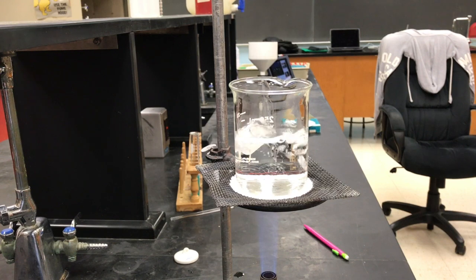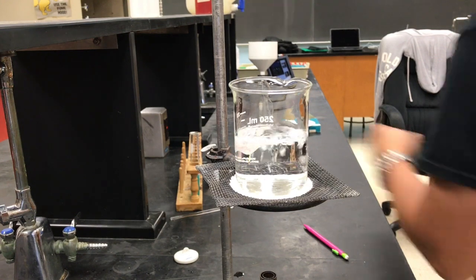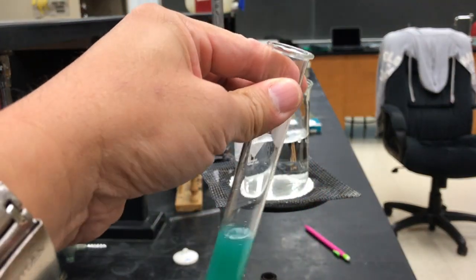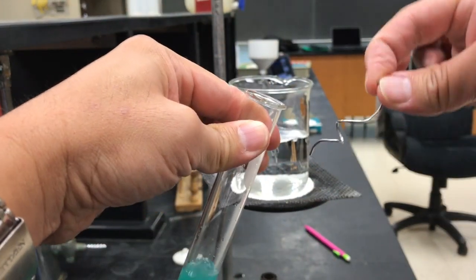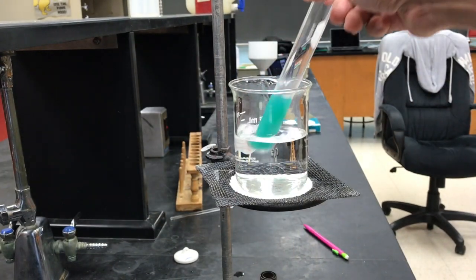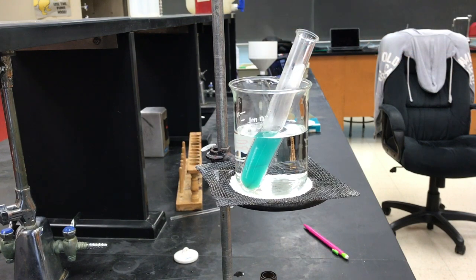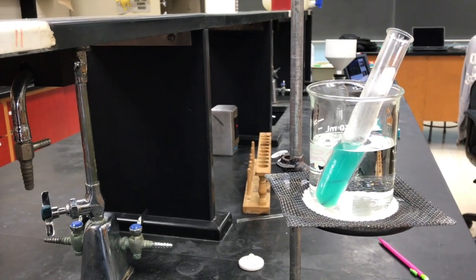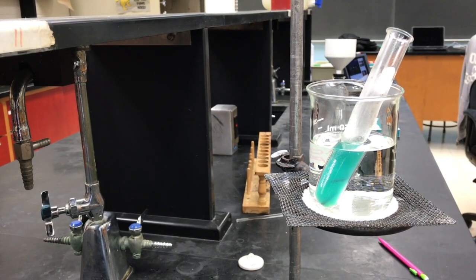So now we've got our boiling water bath. Now that it's boiling, I'm going to go ahead and shut off the heat because I don't need it to be boiling the whole time through. Going to take our test tube with solution and our aluminum wire that's been coiled. Going to drop it in and place it in the bath. And we're going to wait for 5 minutes or so until the reaction is complete. Take note of the color right now at the beginning of the reaction.